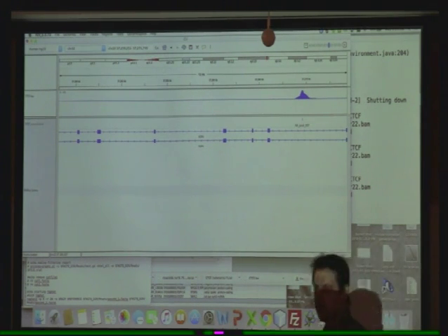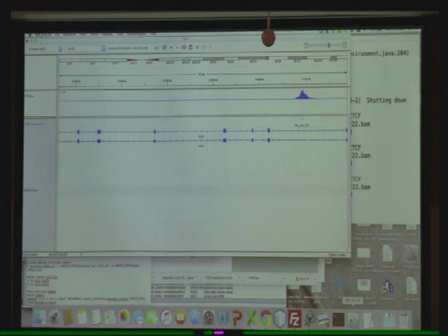From your Mac? Because you're actually in a different computer. So you'd have to copy it onto your Mac and then load it. But we're running everything within some other computer.